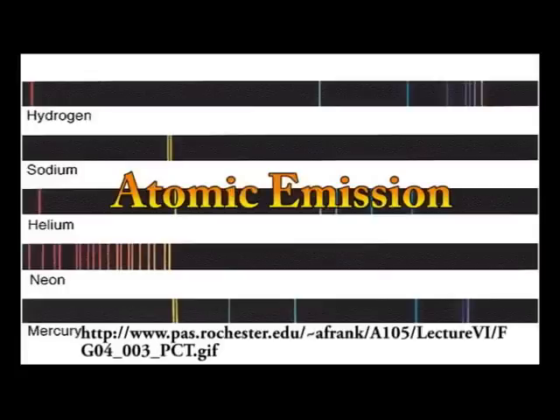In this experiment, you will be carefully recording the emission line spectrum of several elements. When light is passed through a spectroscope, it separates into several distinct bands of color unique to the substance producing the light. By recording which bands of color, or wavelengths, are present from a light source, the elemental composition of that light source can be identified by matching the specific color bands to that of known spectra.